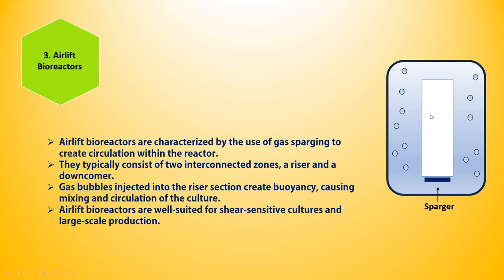So these are the two zones. This is the riser zone, the white colored region, and outside, the blue colored region is called the downcomer zone. Gas bubbles are injected into the riser section, creating buoyancy, causing the mixing and circulation of the culture.